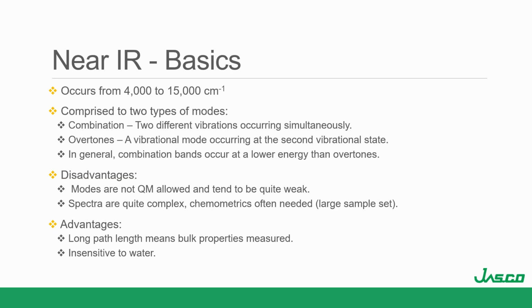One of the industries that use this are food and feed industries where they have grain. And the grain has a little bit of water in it, and you want to look at bulk samples, so you just put it all in a cup and then integrating sphere, and then you can run it. So you can do quality control.